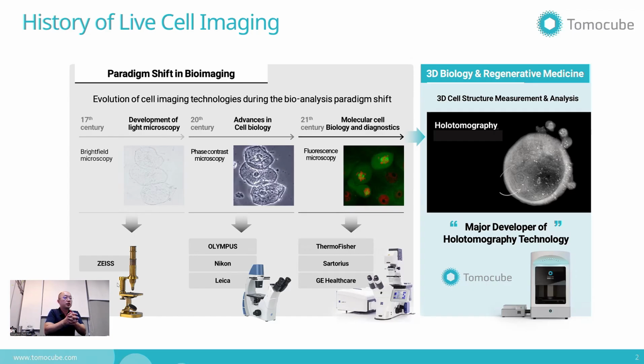That's why Zernike came up with a very clever idea of using phase contrast with the interference phenomenon to increase the imaging contrast. So by simply inserting the phase filter into a bright field microscope, you can significantly increase the optical contrast for unlabeled sample images.